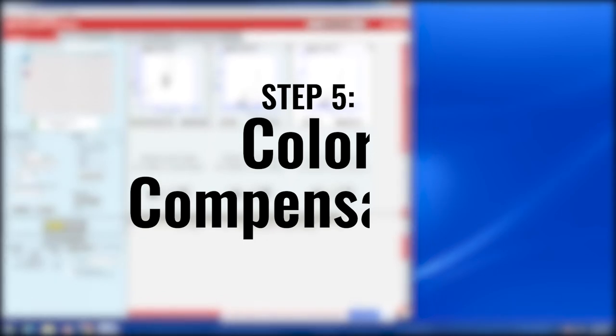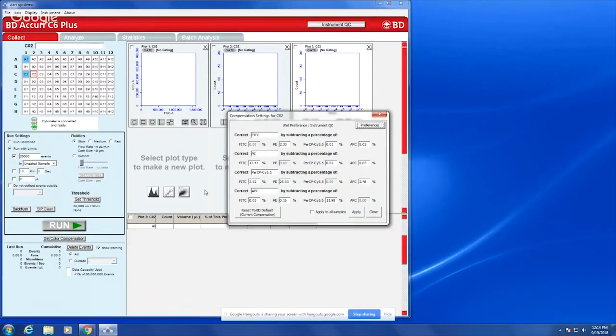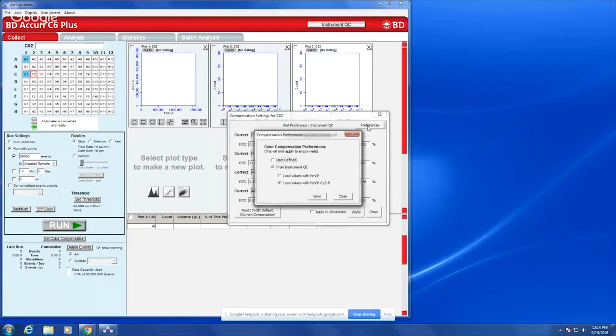On the computer, select Set Color Compensation directly under the Run button. Click on Preferences in the top right-hand corner. Choose from Instrument QC and select Load from PerCP or PerCP-Cy5.5, depending on the color you are using. Select Save.